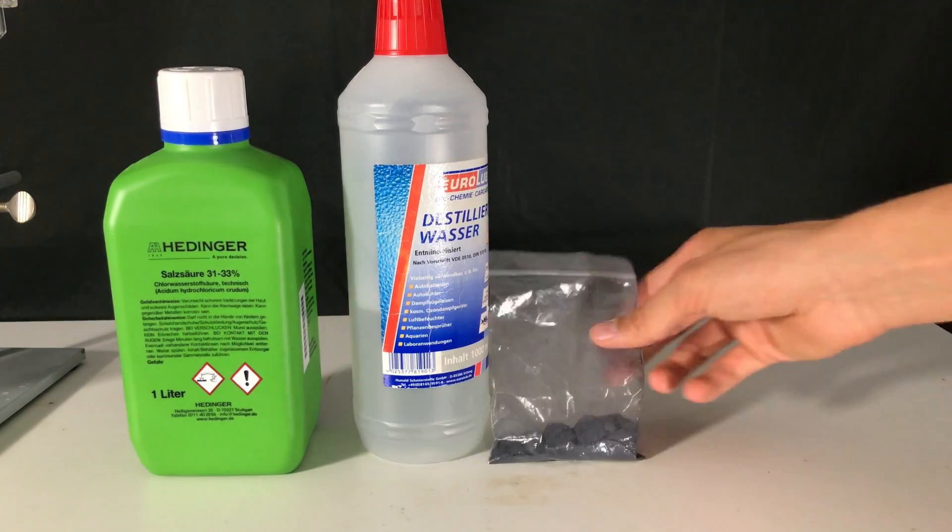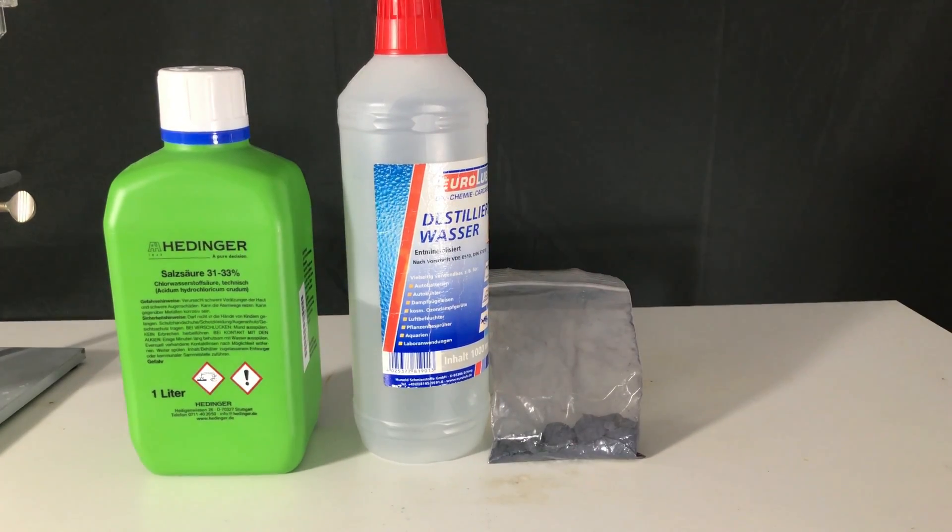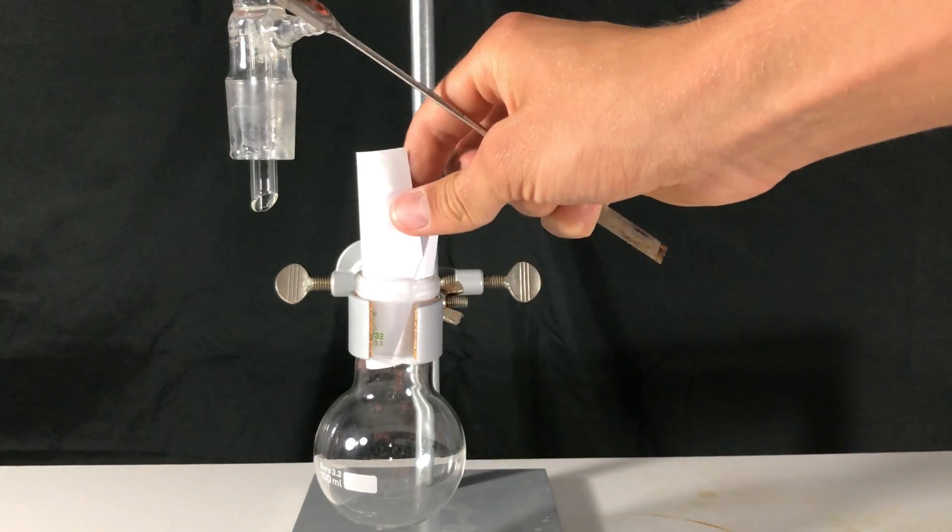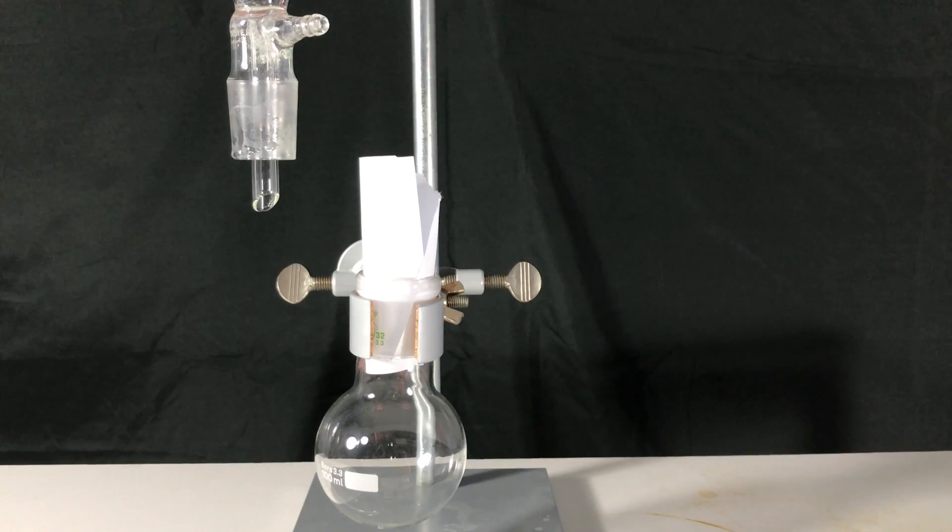As silane is toxic, you should not try this experiment at home. We start off by filling a 100 mL round bottom flask with a bit of our magnesium silicide.